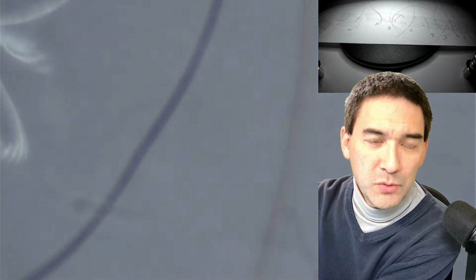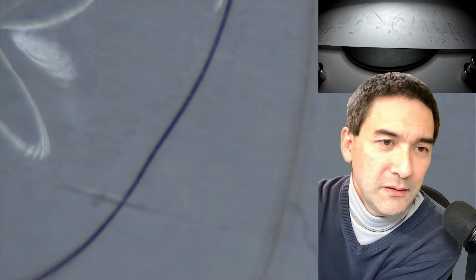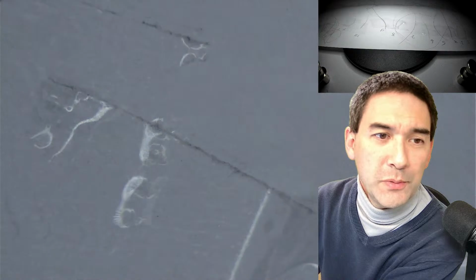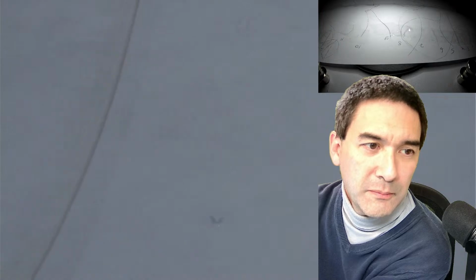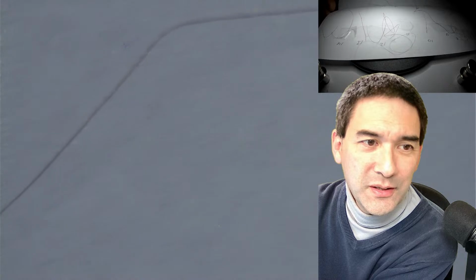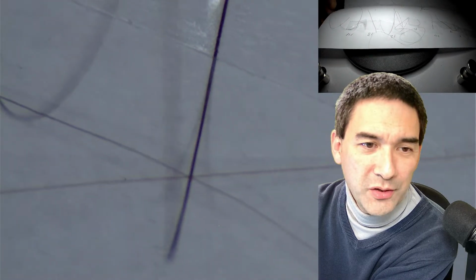I'm zooming out here a little bit. I have to focus. I have to reach over. And the reason why I would like to show it to you also under the stereo microscope is because it gives you a little bit of a perspective on how thick the hair actually is. Generally, as you see, it's not the best. Here we go. That's actually one of those hair, right?